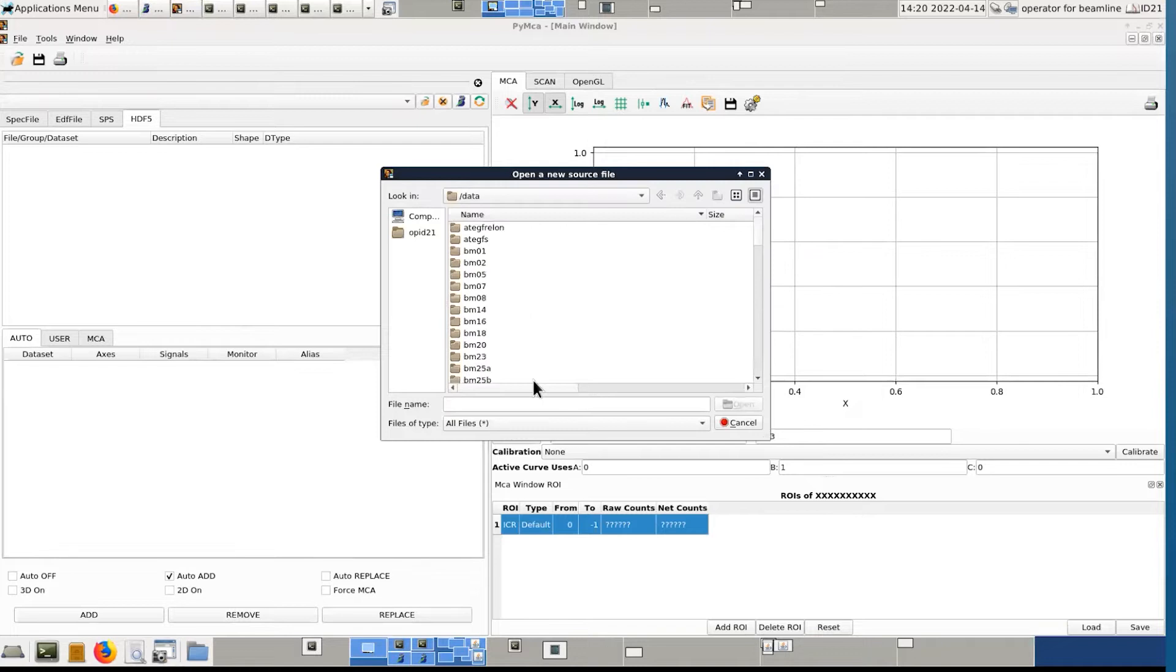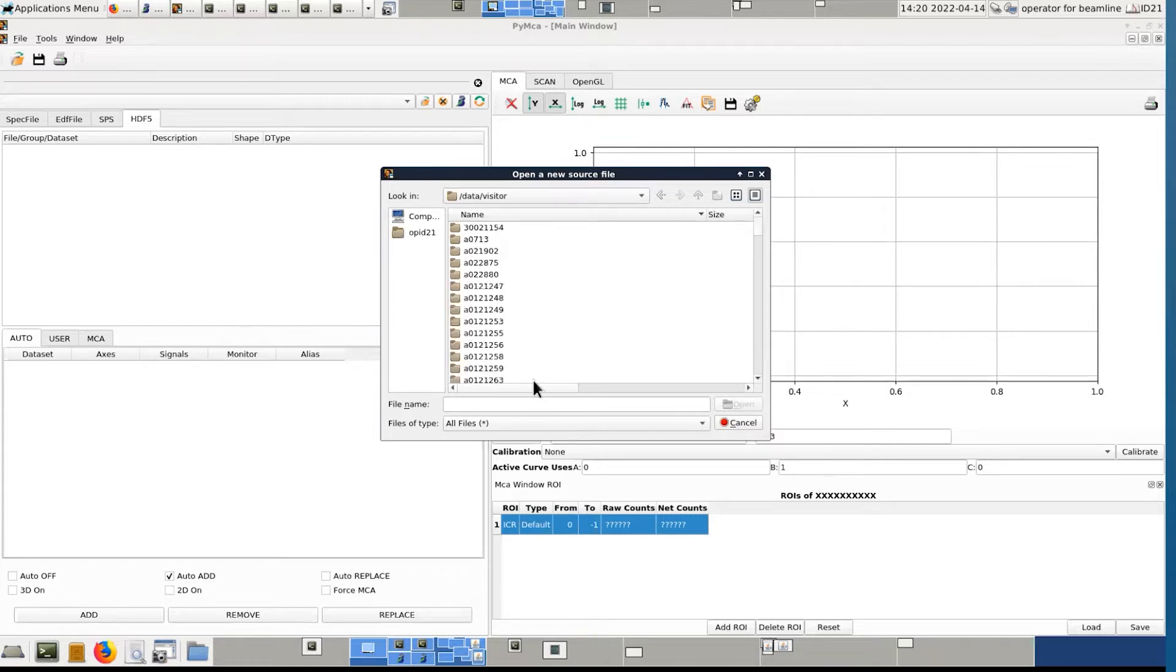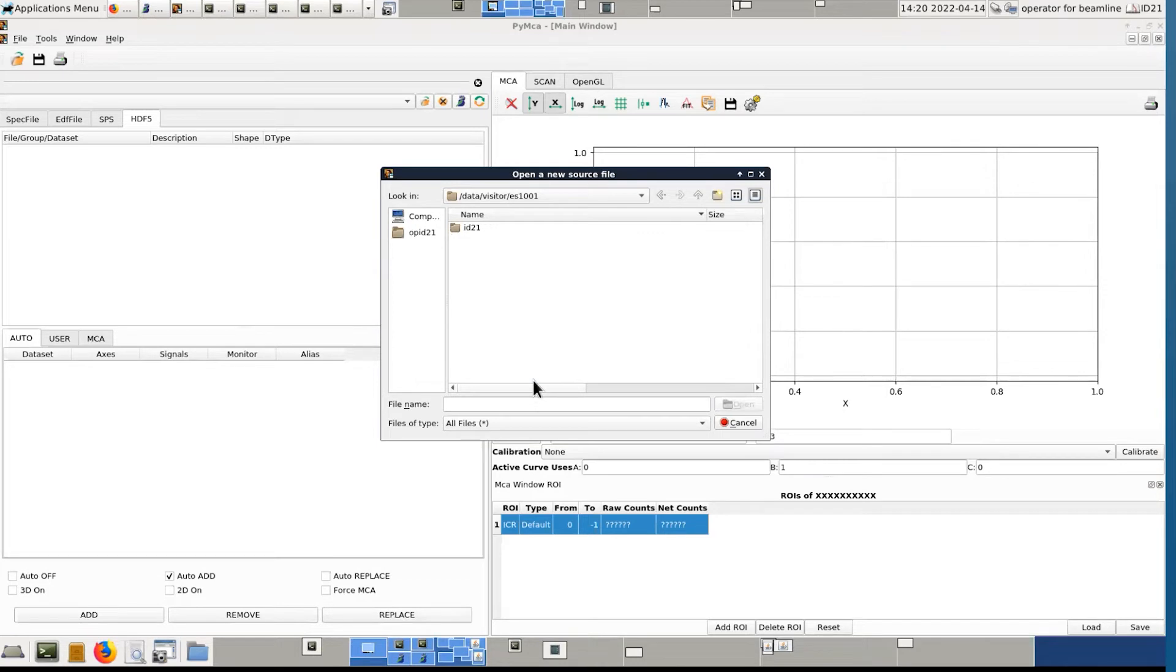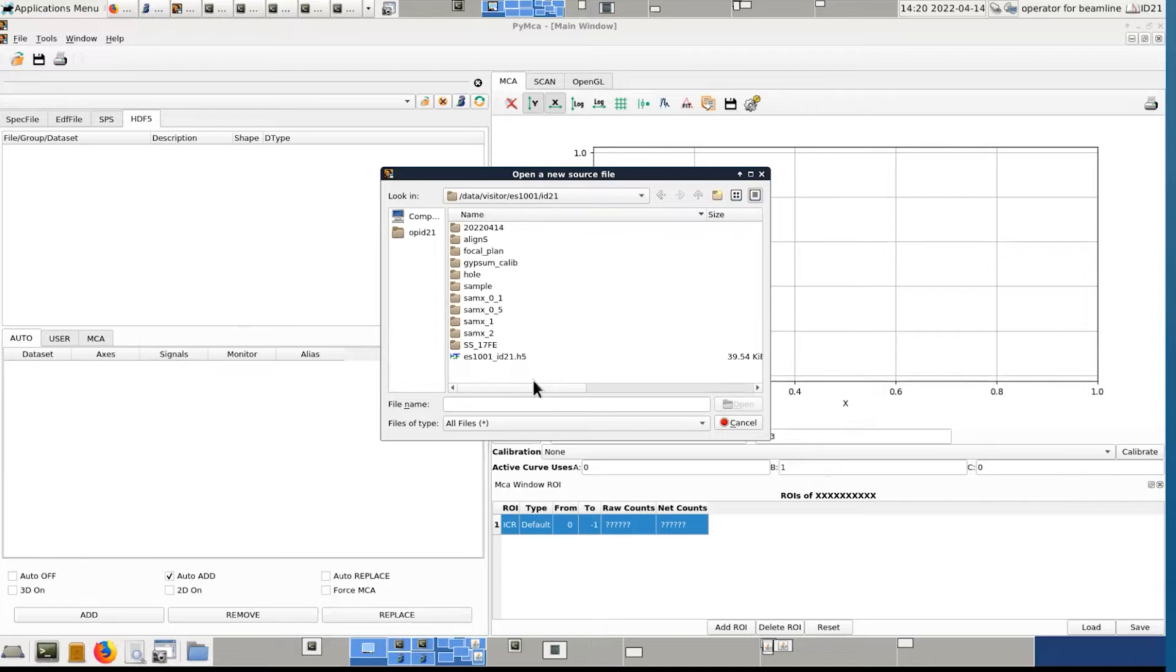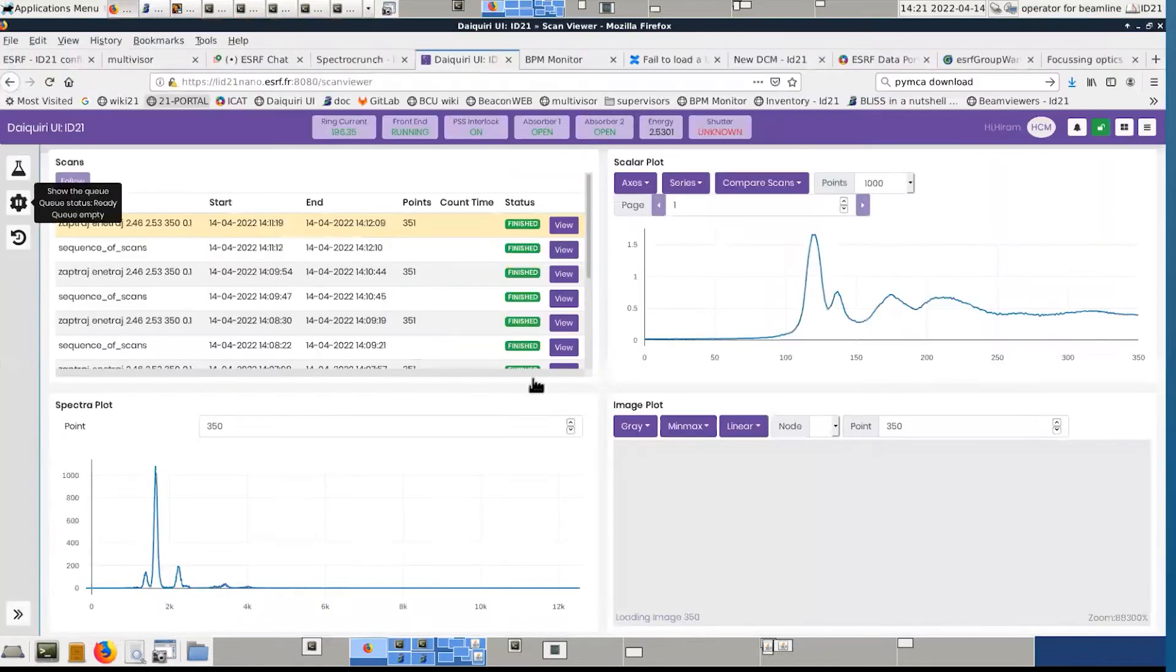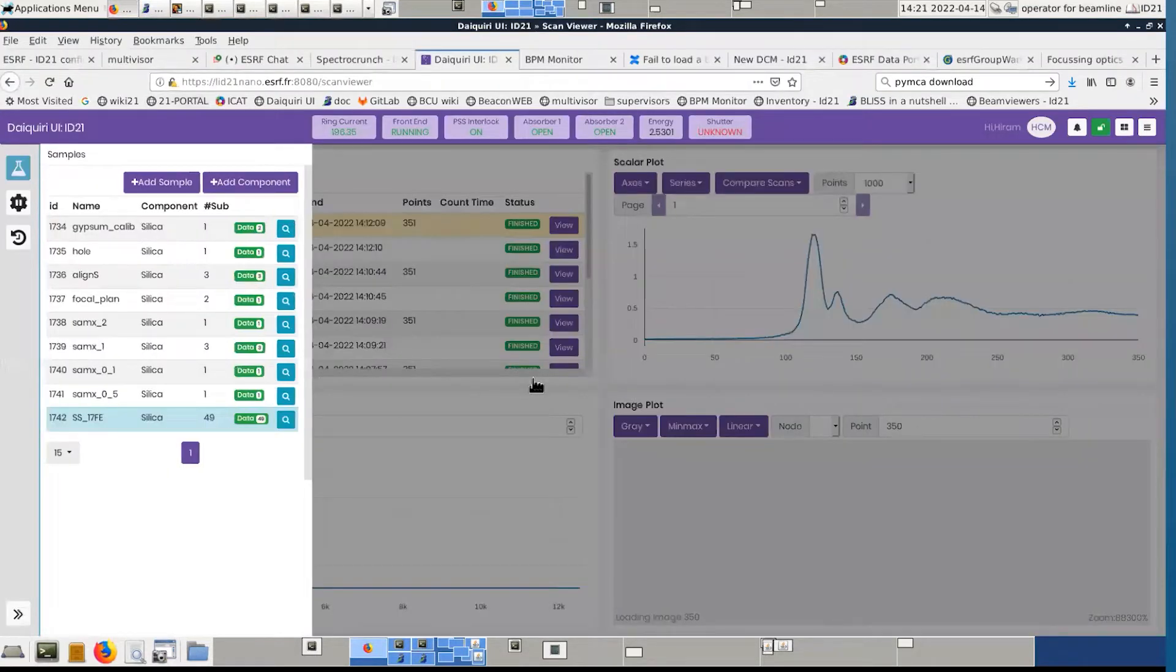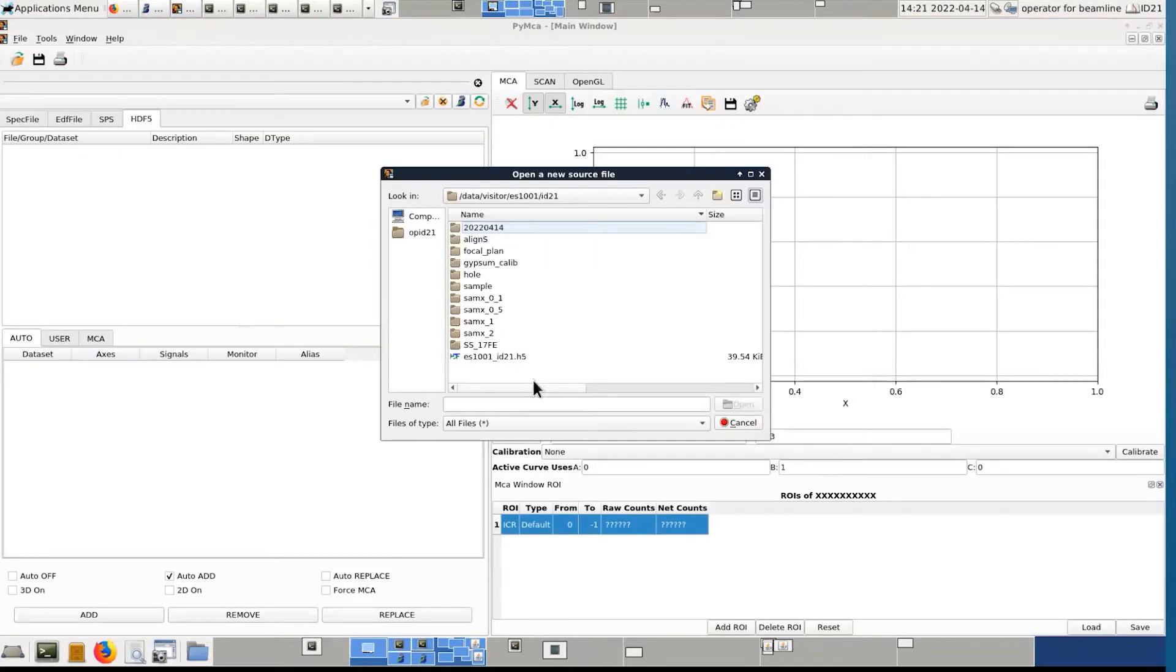So there are other data, visitor, and then the name of your experiment. In your case, ES1001. ID21, because that's the only beamline where you have beamtime. If you would have had beamtime at several beamlines, you will see several folders. What you see here is one folder per sample.